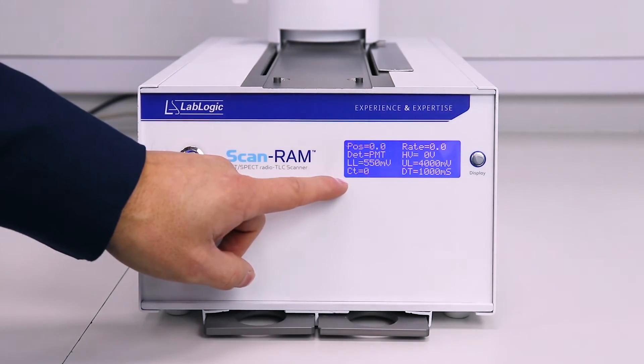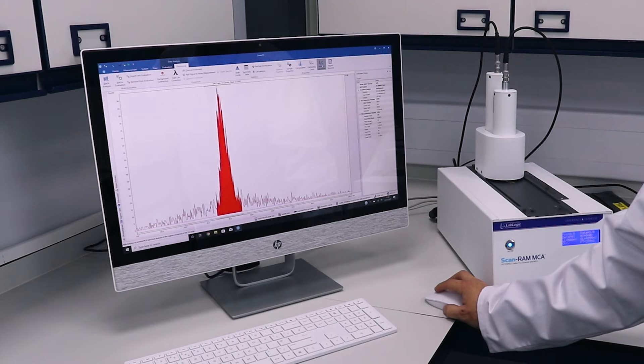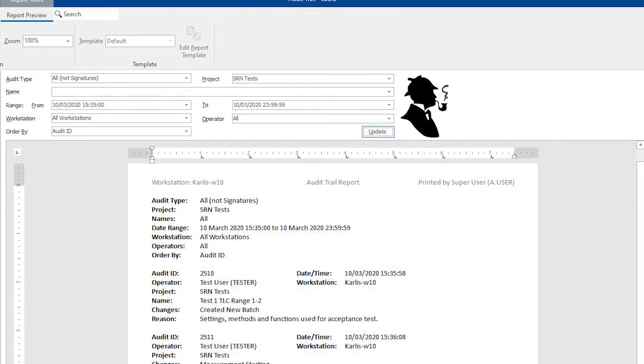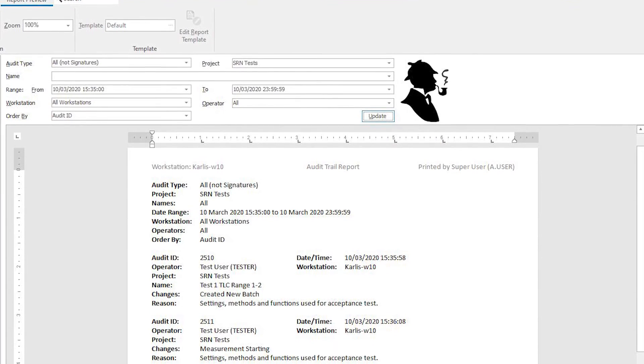On the front-end display you can easily view the instrument and the run parameters. You cannot physically change any settings on the instrument. This has to be done using Laura software with a full audit trail which records what was changed, who made the change and when.